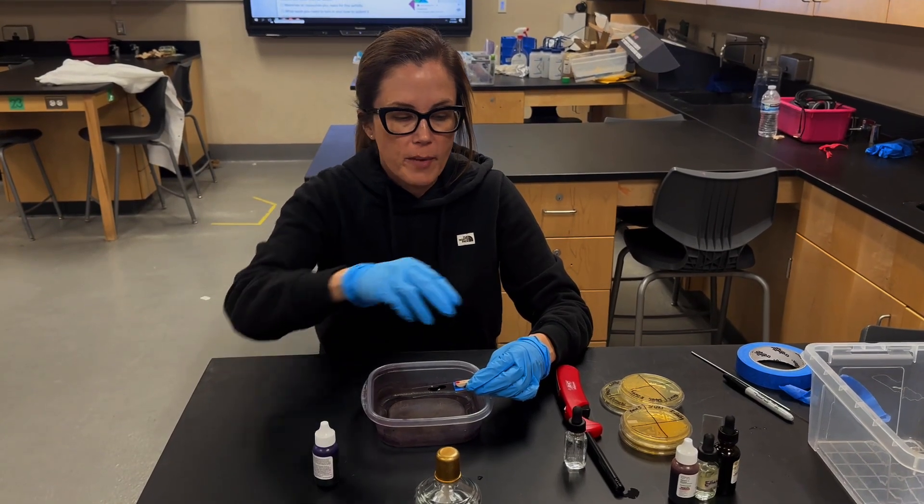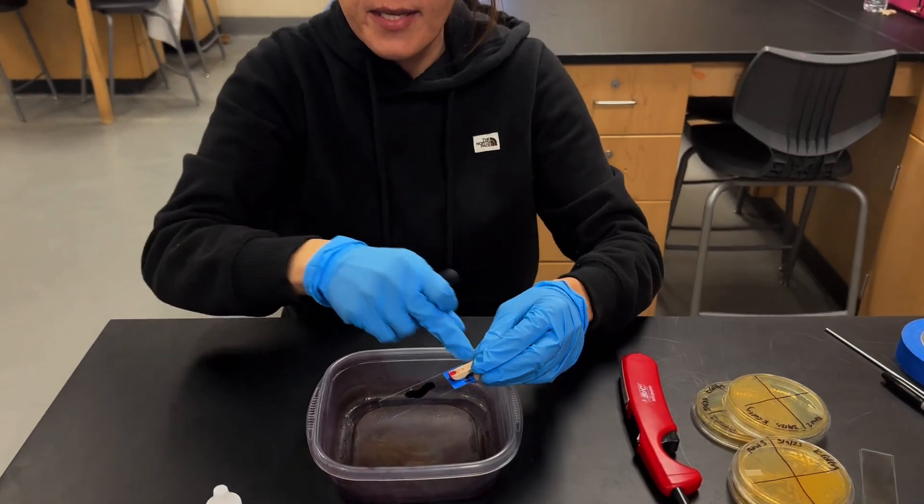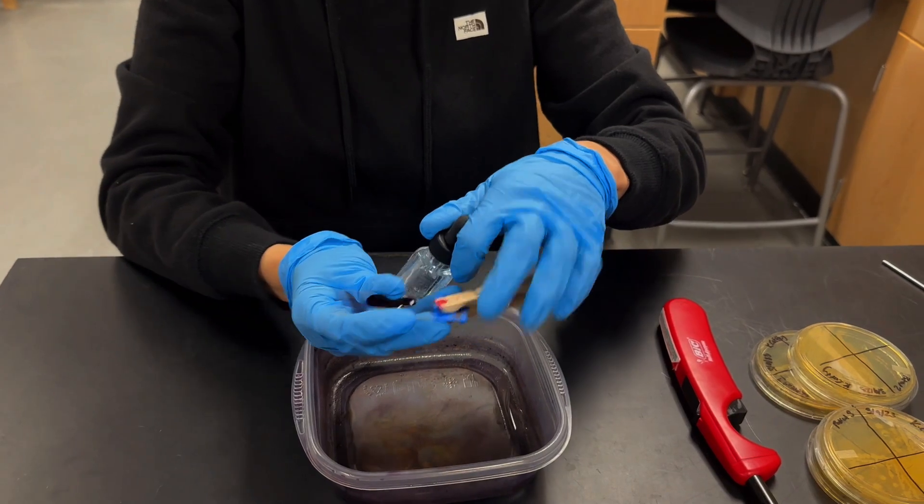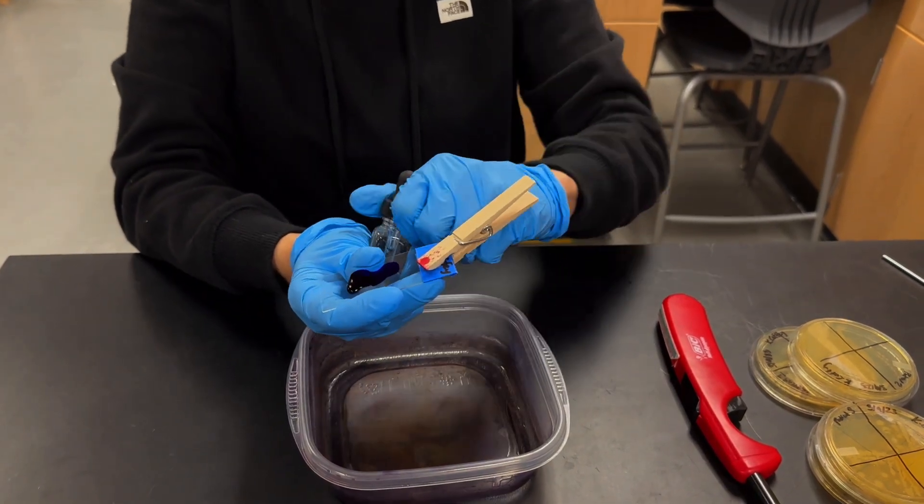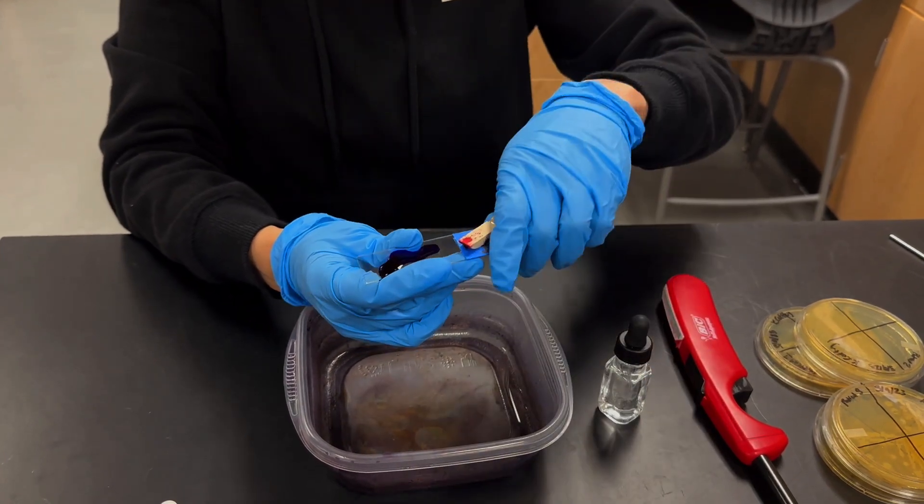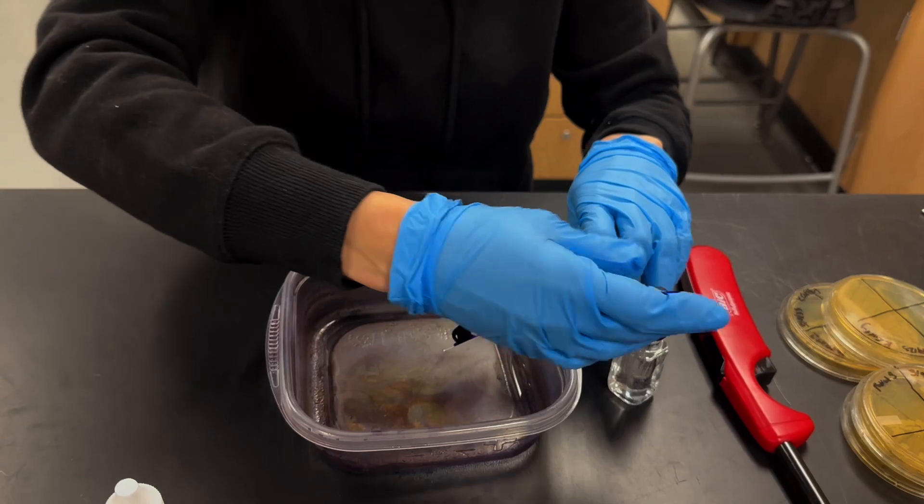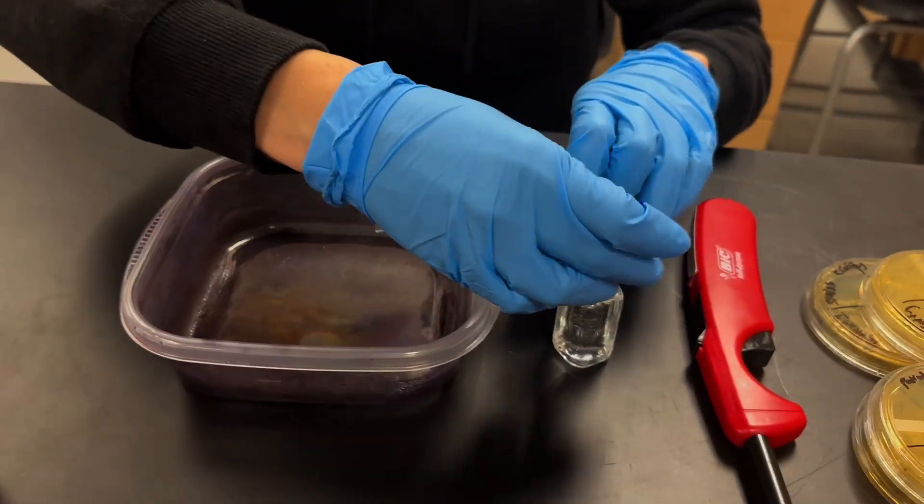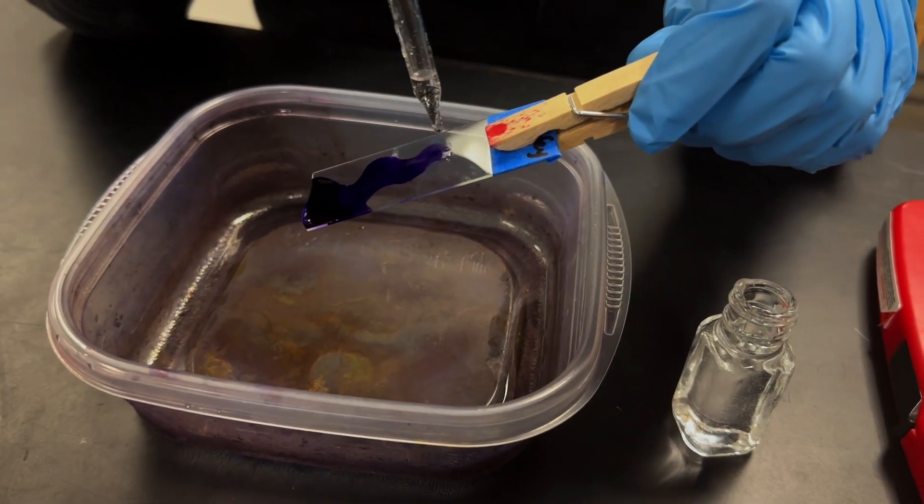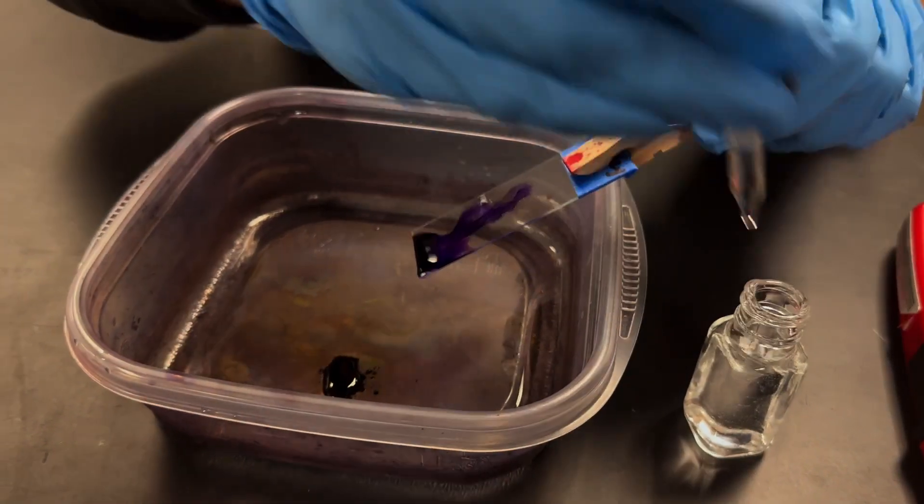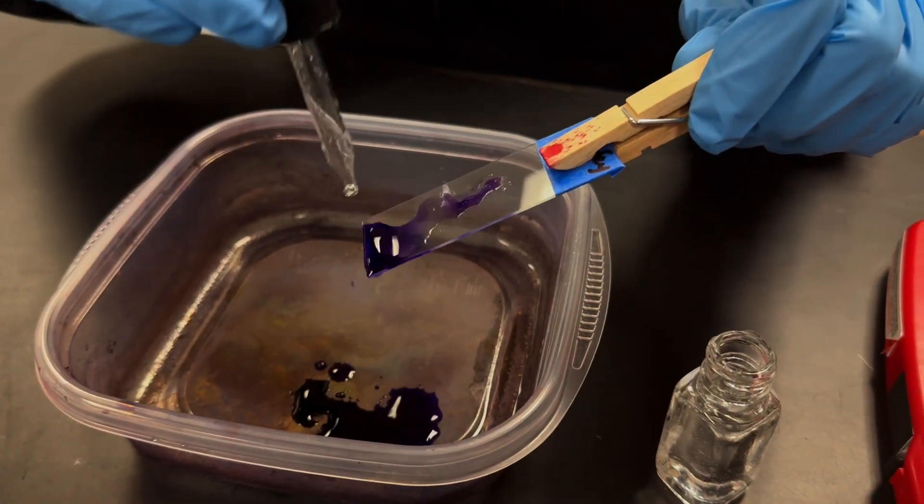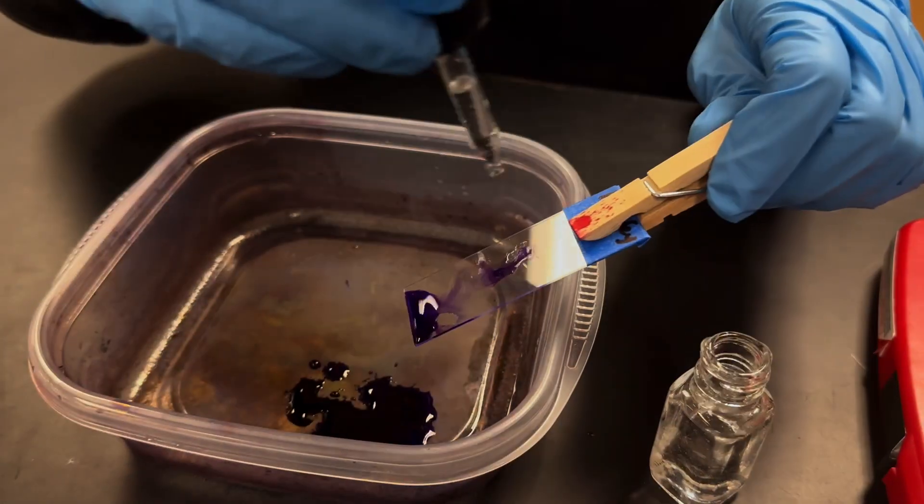So once the stain has been on for one minute, we're going to take the water and we'll be rinsing the stain off of the slide using the water. Remember the stain can stain your clothing. So you want to be careful as you're using it in class. It's probably helpful if you have a lab partner to help you with this part and you're just going to rinse it down like this. Remember a minute has passed. We're going to rinse it until most of the color has come off this slide.